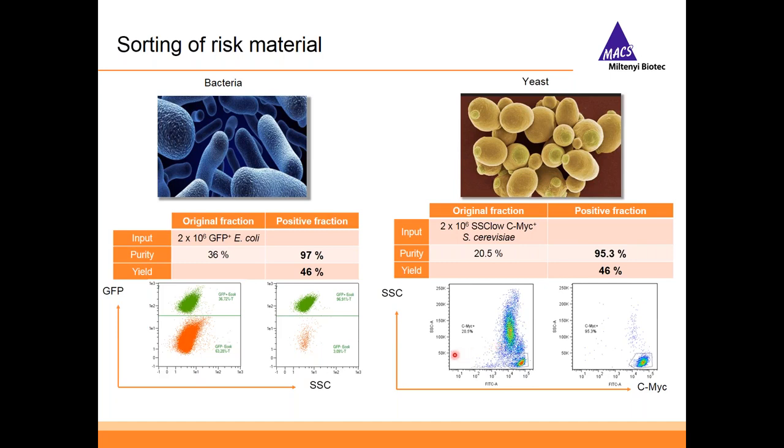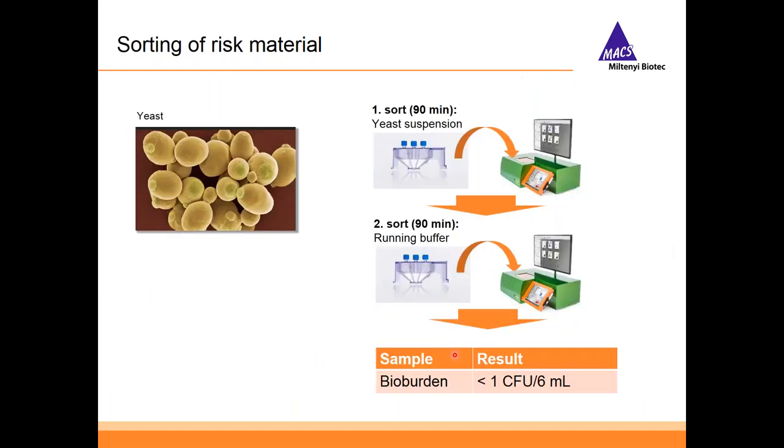But important, we also think we don't have any carryover in the instrument between samples. And of course, we tested this with several different tests. I would like to show you one of them, for example, here for the yeast.